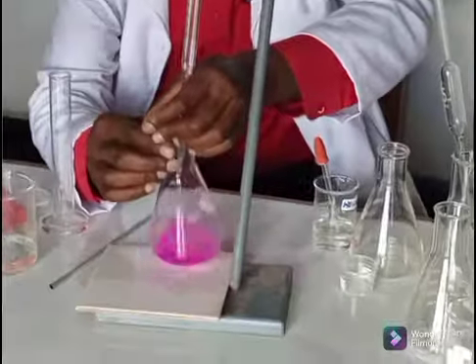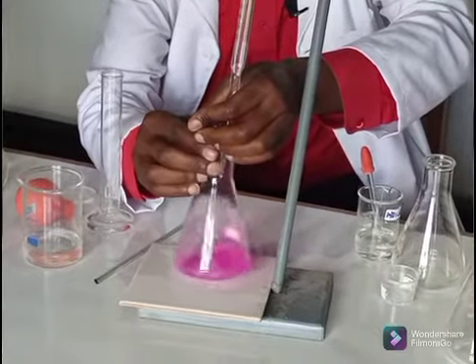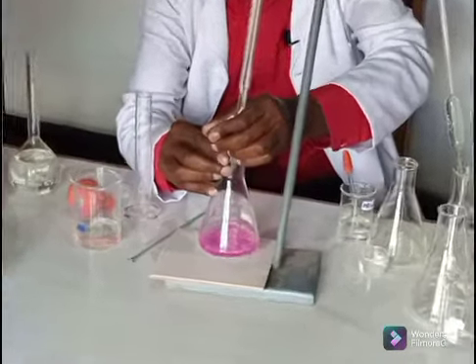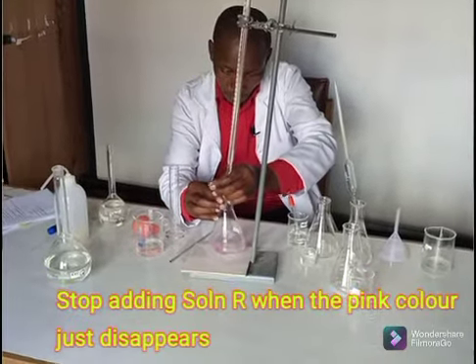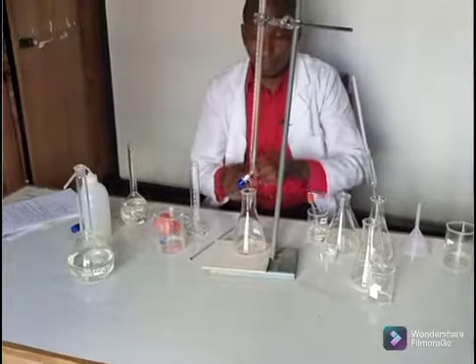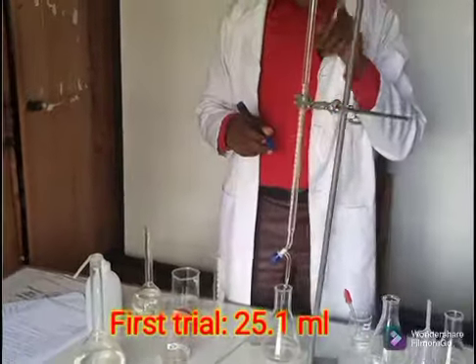So I'll keep adding. I'm doing a titration process. Almost there. Good. With that, I can do the reading. 25.1. So the volume there, if I do my recording, is 25.1. Remember, that is my first trial.